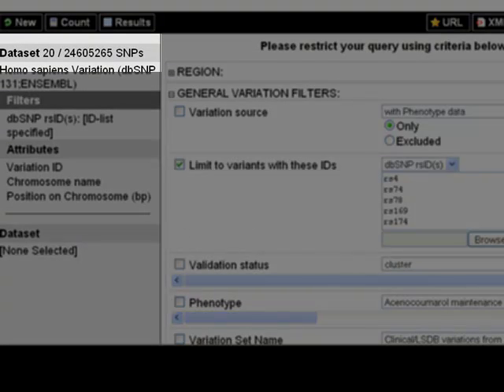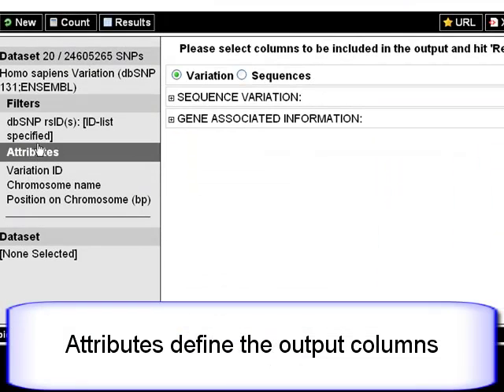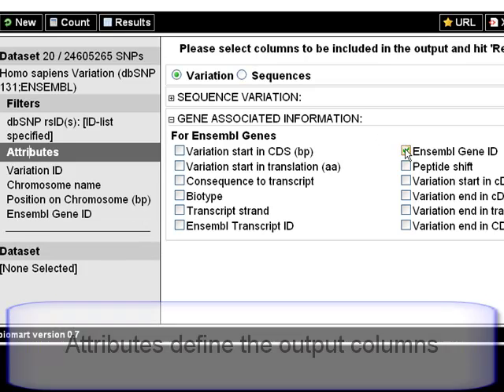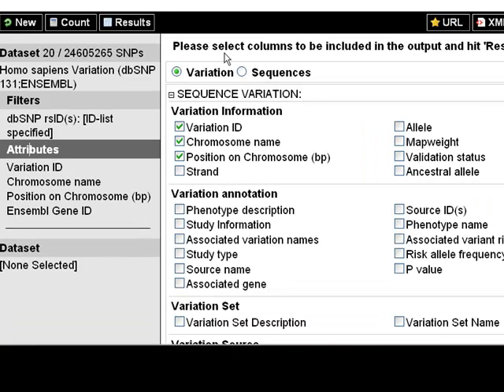What would I like to know? Click Attributes for output options. Attributes define the columns in the output table. I will choose the Ensembl gene ID.